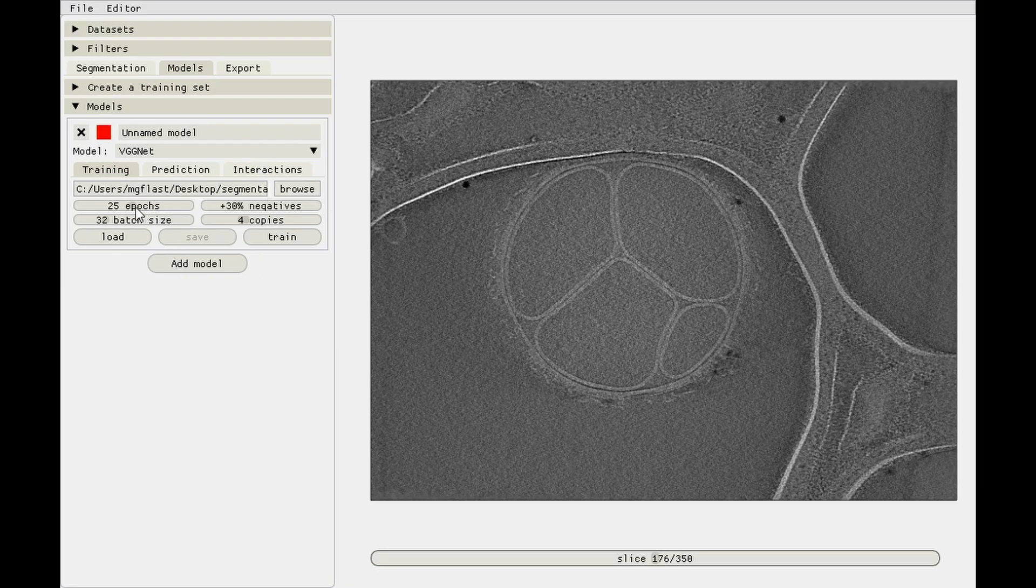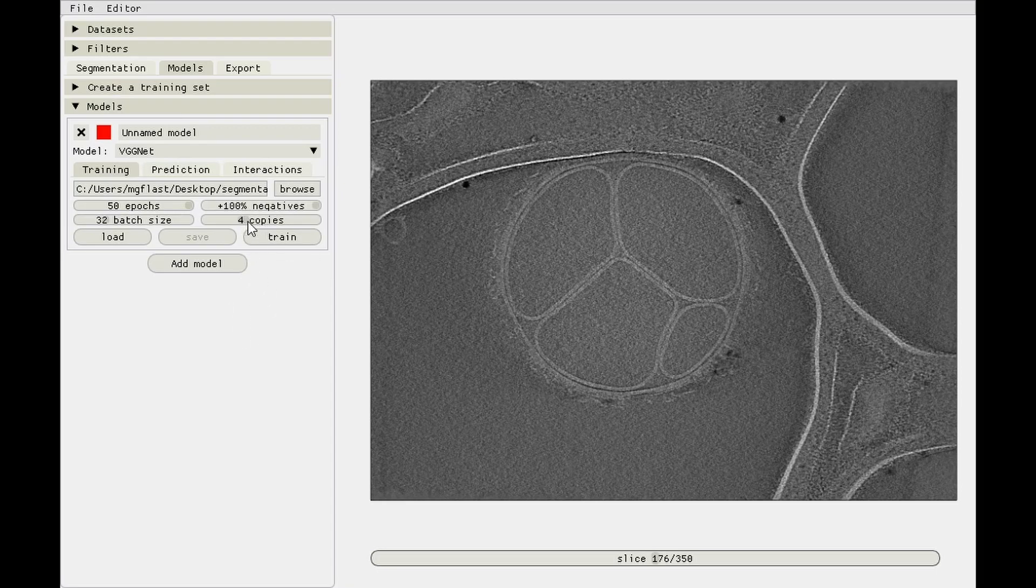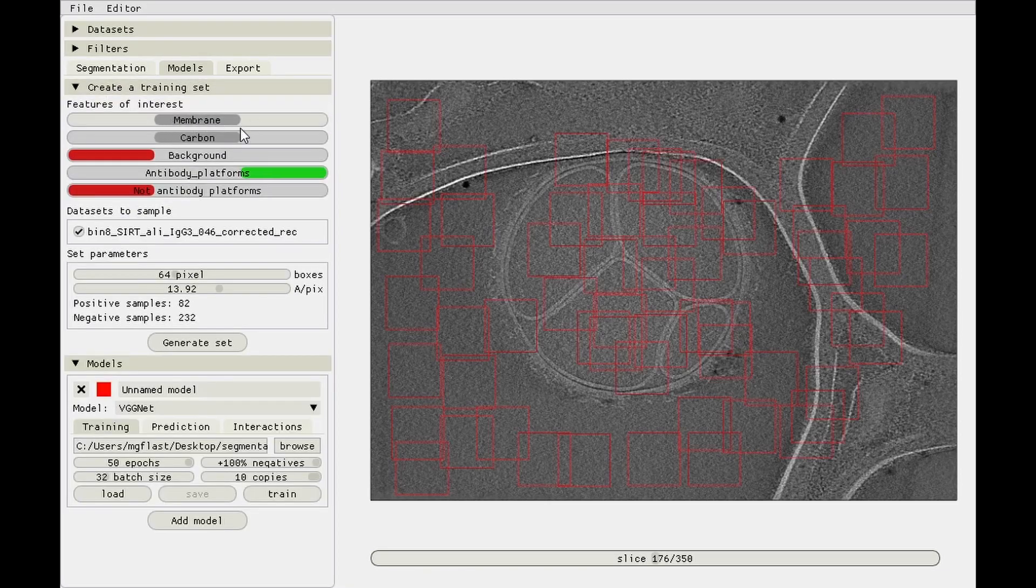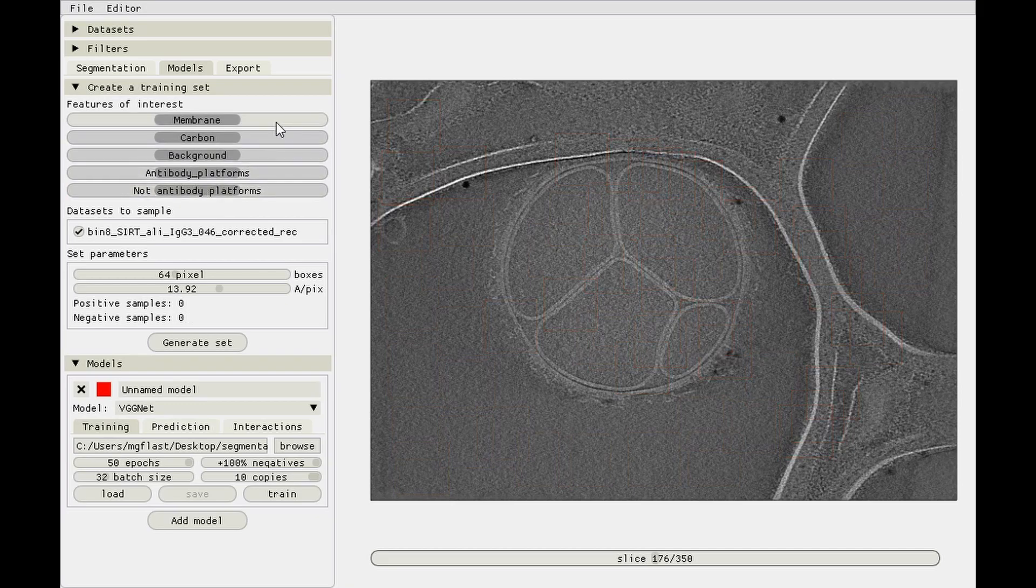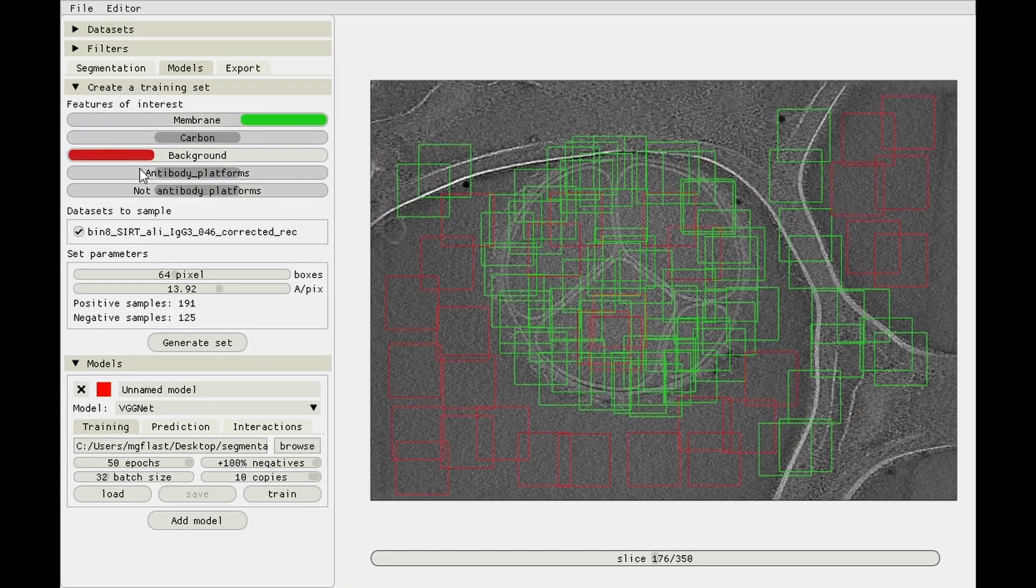So maybe a UNet with 27 million parameters would actually work better than Pix2Pix, but for now we'll stick with VGGNet which we know works well. We'll use that for the membranes. Load the membrane training set, make it do 50 epochs, we can always stop it if it takes too long.